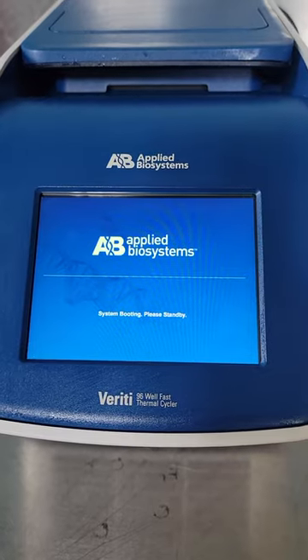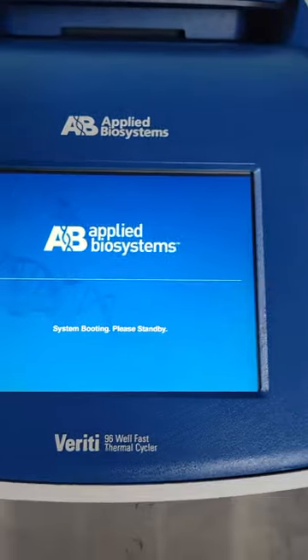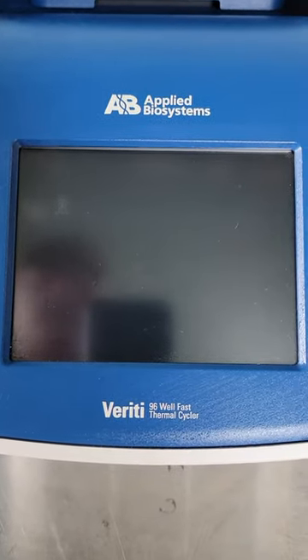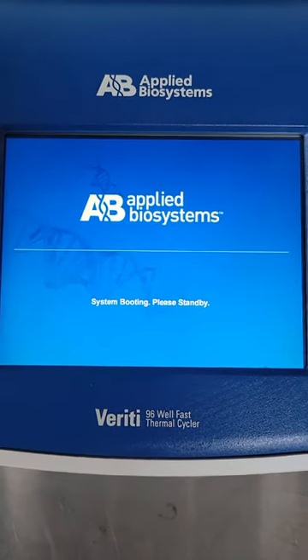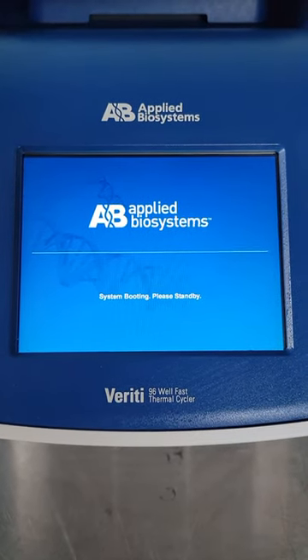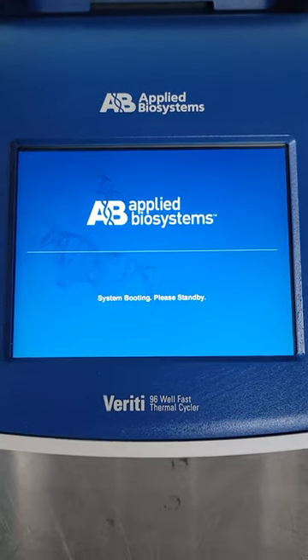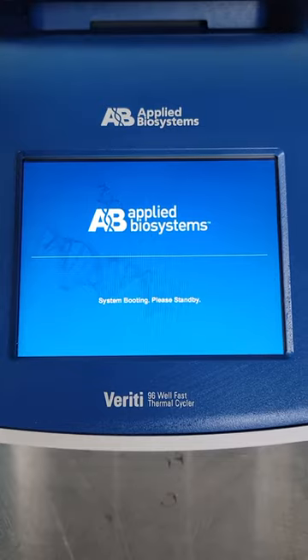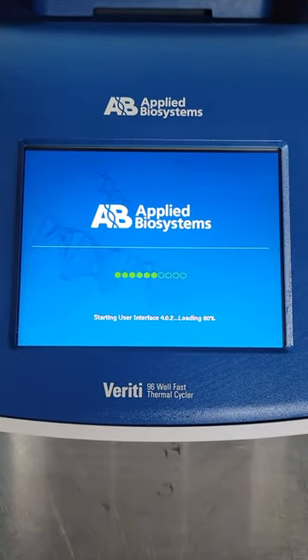That's the standby screen, as it should be. As it boots up, the next screen will show that there's some sort of error. We don't know exactly what the error is, but it starts to boot as it should.